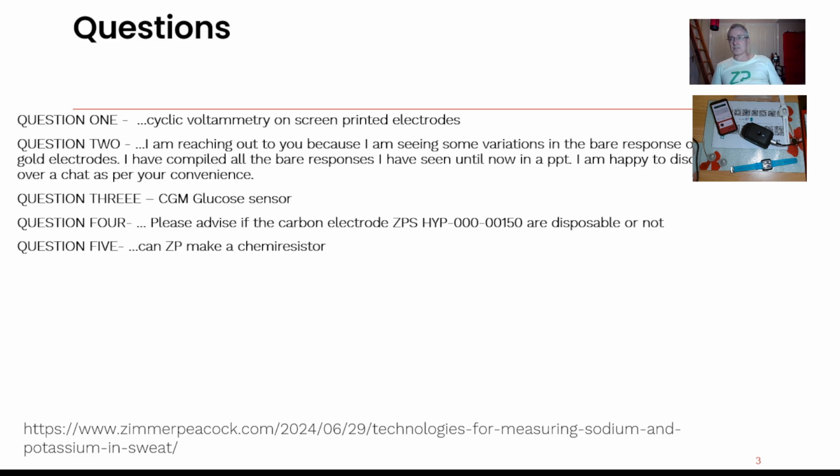The way that the device is described in the paper, it's not scalable. It's not something you can really manufacture. I'm going to describe that you should actually take some of our, for example, Hypervalue carbon electrodes like this, formulate the ink from the paper and just drop cast it onto this, and that's how you'll actually end up making those chemiresistors.